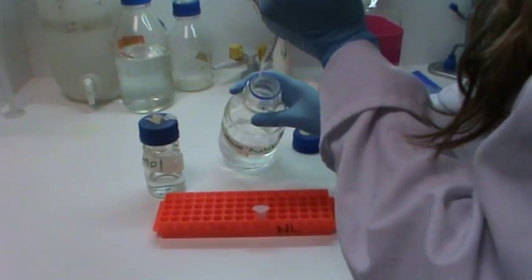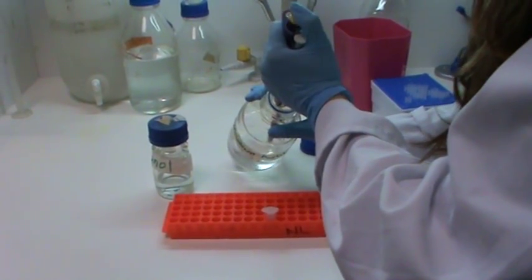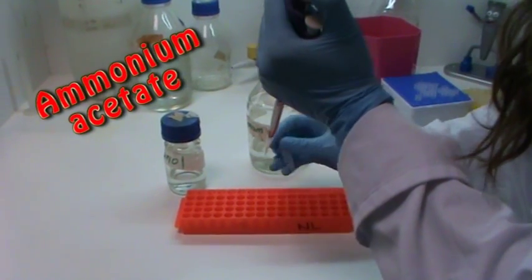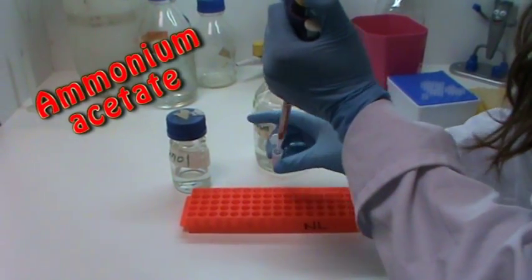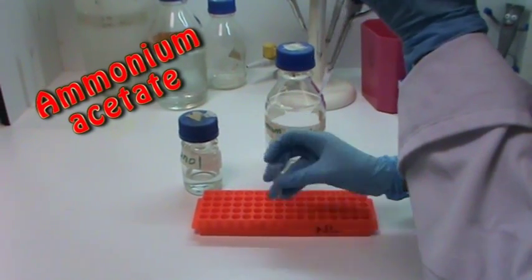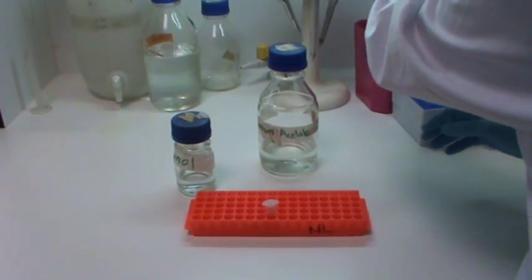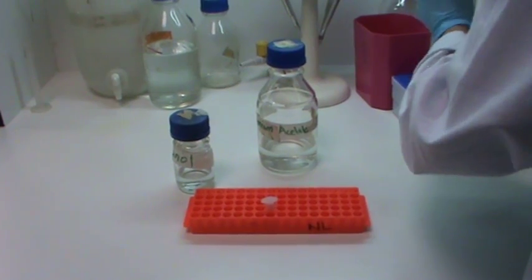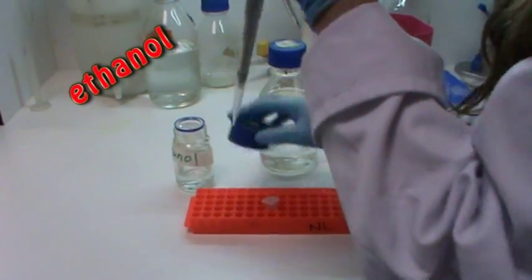I am now going to precipitate the DNA out of solution. First I am adding ammonium acetate. Ammonium acetate is a type of salt. Next I am adding ethanol. DNA is insoluble in ethanol.